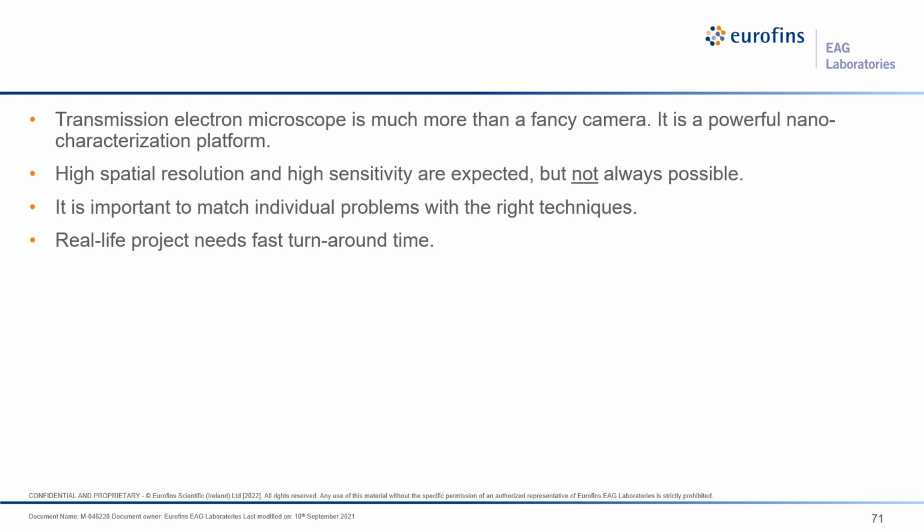And these days, the resolution most of the time is limited not by the microscope itself, but by your sample, right? Unfortunately, we cannot do anything about that at this moment.